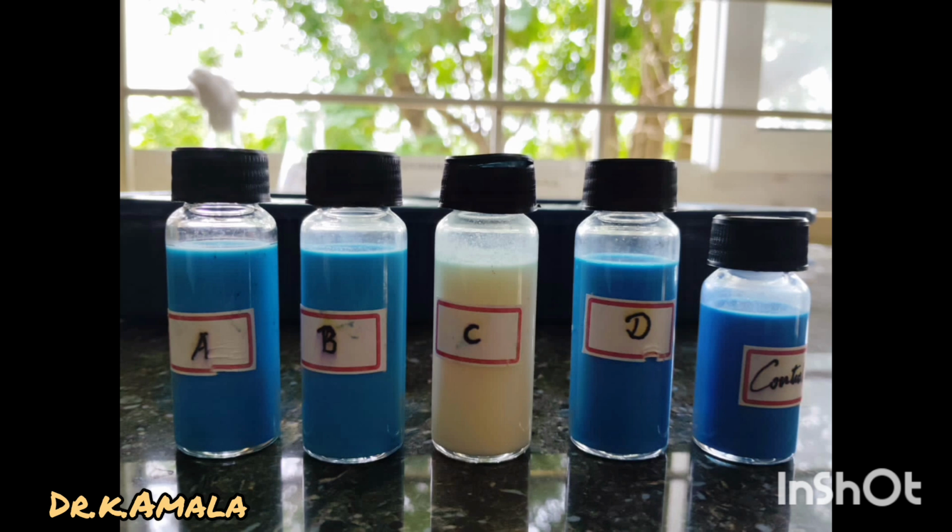An important note: the test can be performed at room temperature, that is 25 degrees Celsius, 77 degrees Fahrenheit, for 60 minutes. But incubation at 37 degrees Celsius, that is 98.6 degrees Fahrenheit, for 30 minutes is recommended for more accurate results.